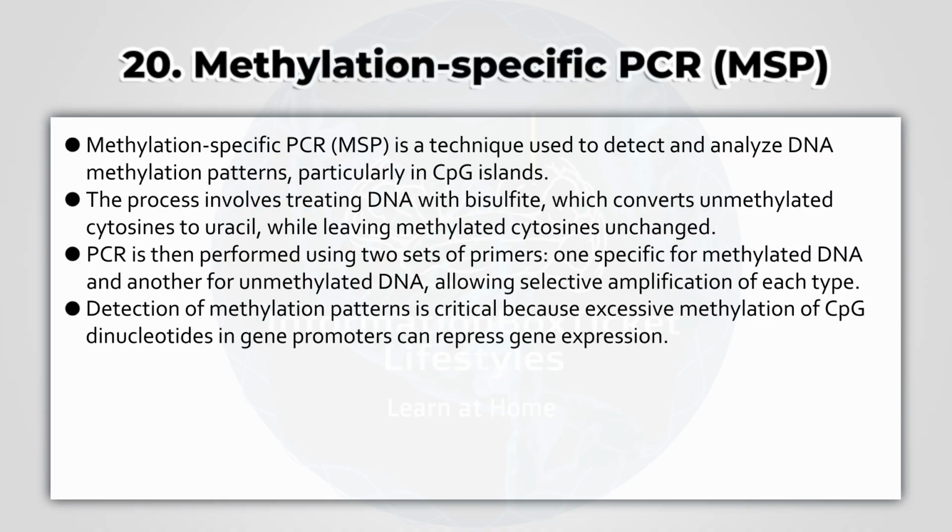Detection of methylation patterns is critical because excessive methylation of CpG dinucleotides in gene promoters can repress gene expression.